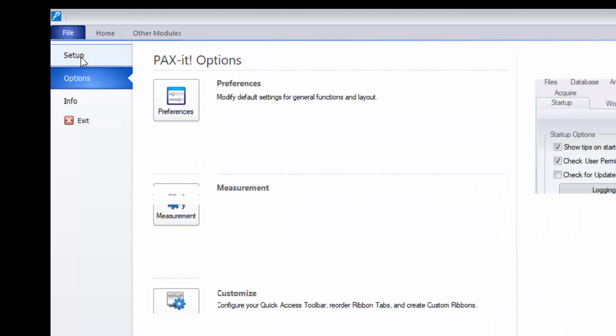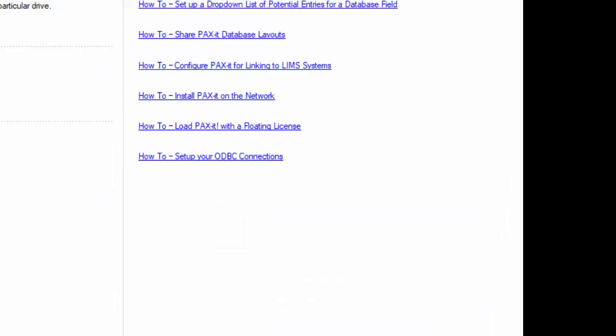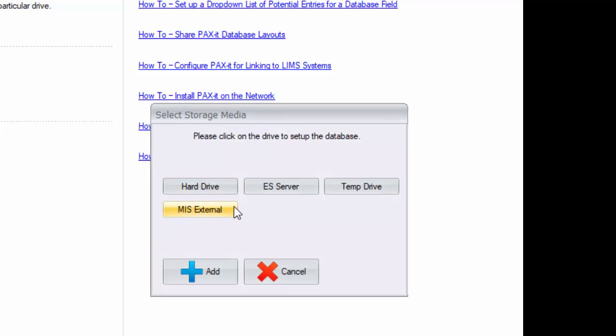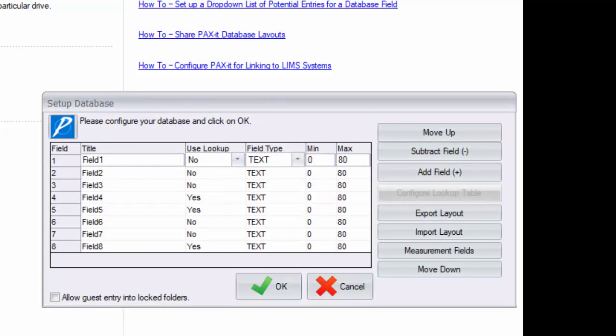The database layout screen is accessed by navigating to file, setup, database, setup database. Choose the collection to define a database layout for and the screen pops up allowing you to accomplish the task.